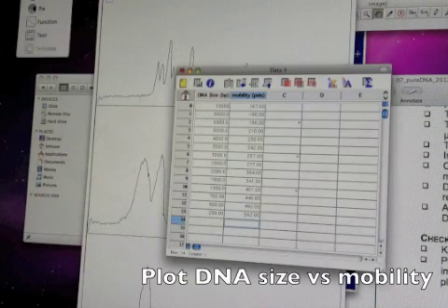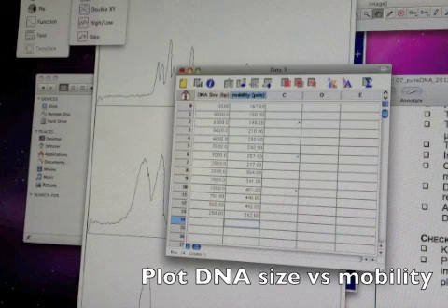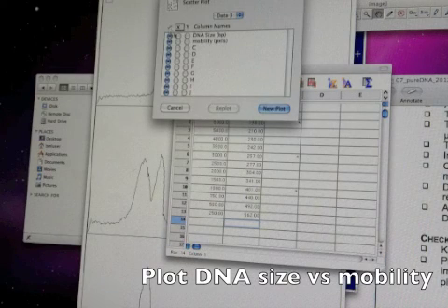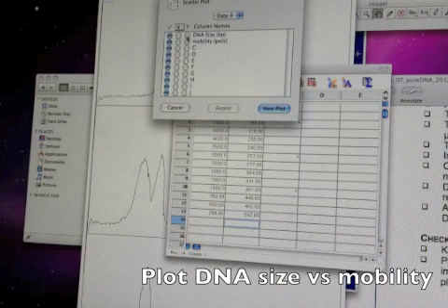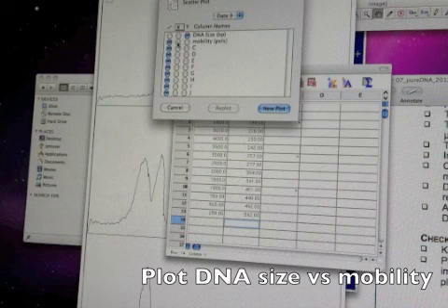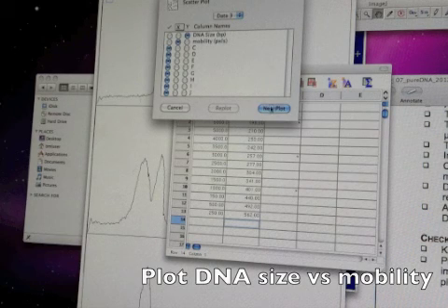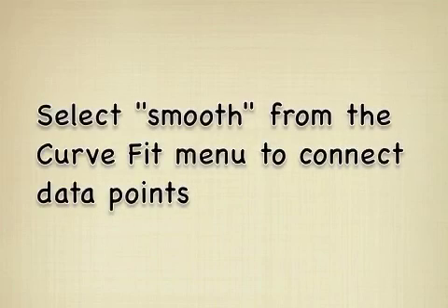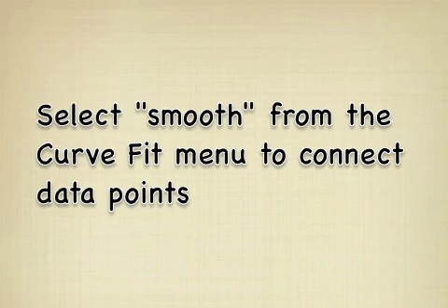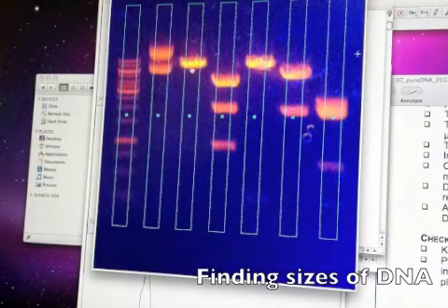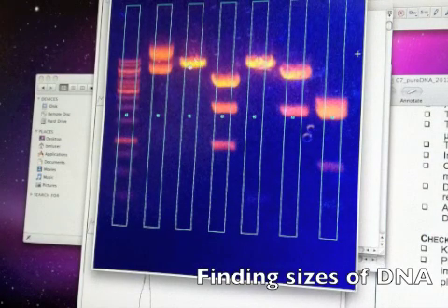From the gallery I'll choose the scatter plot and I'm going to plot DNA size on the Y-axis and mobility on the X-axis. Let's see, analyzing this lane over here, lane number three.